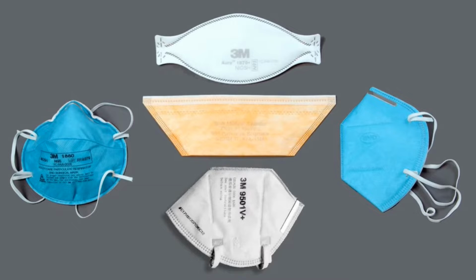Today we're going to be talking a little bit more about masks. There are many different types and shapes of masks, and as you can see in these pictures, these are just some of the P2 or N95 masks available.